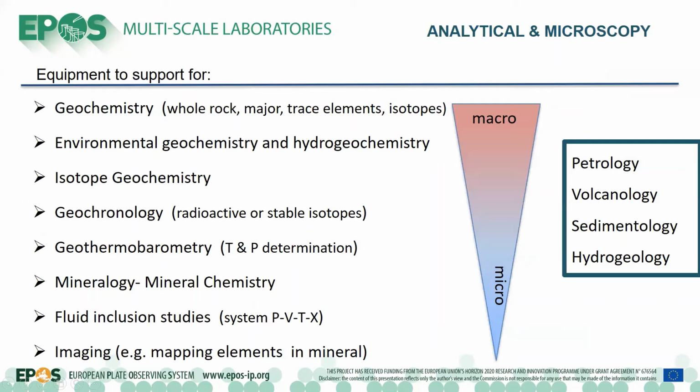So this equipment is the support for geochemistry studies. That means to obtain the oxides, major, trace, and isotopes. For environmental geochemistry and hydrogeochemistry, isotope geochemistry, geochronology, geothermobarometry, mineralogy and mineral chemistry, fluid inclusion studies, and imaging.